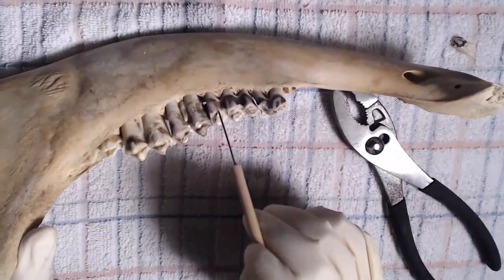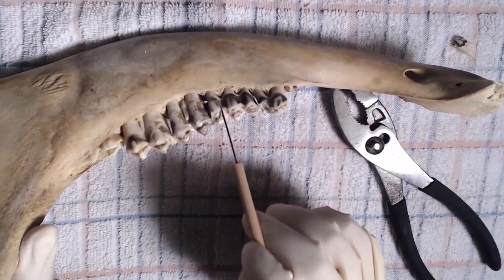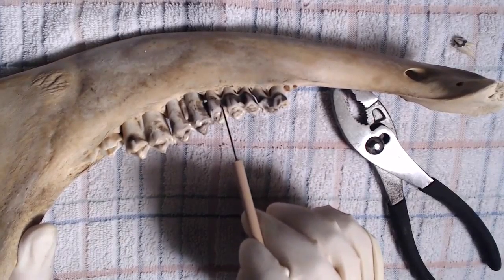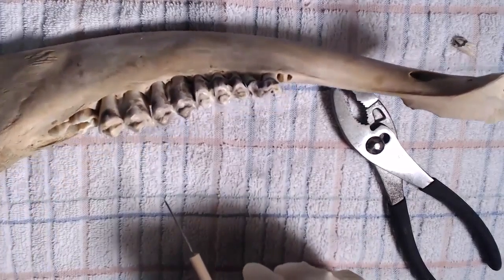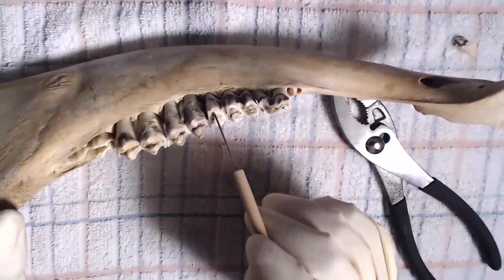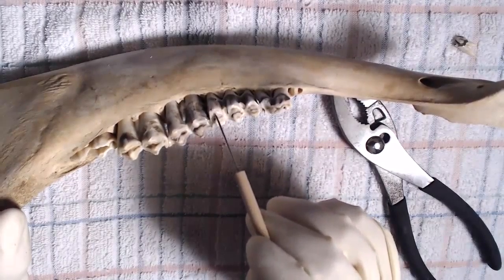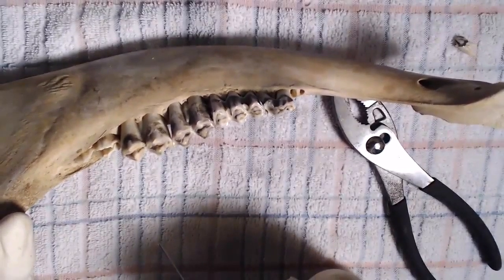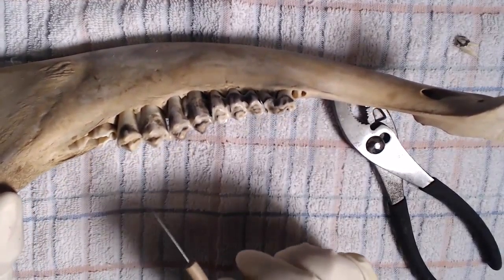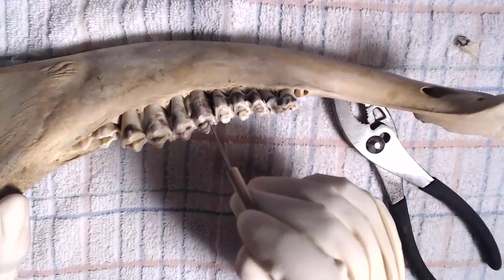So you can see on the very outer edge, remember that white pearly covering is the enamel. Okay, so go ahead and identify that. Next, we kind of see an orangish colored layer just beneath the enamel. And that's the dentin. And then in the very center of the tooth, you can see the pulp.